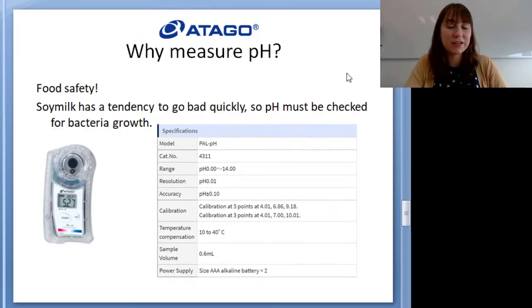So that covers the two handheld refractometers from Atago for measuring soy milk for tofu production. The main takeaways are that there are several points in the tofu-making process where you can check concentration, and the more you check, the better you can dial in your quality control. Being consistent and getting the same number every time means consistent product, and consistent correct product means high customer satisfaction. That is the main secret to getting tasty, consistent tofu.